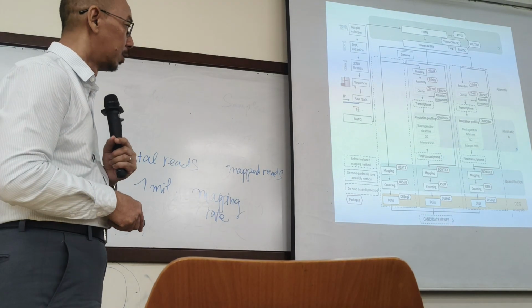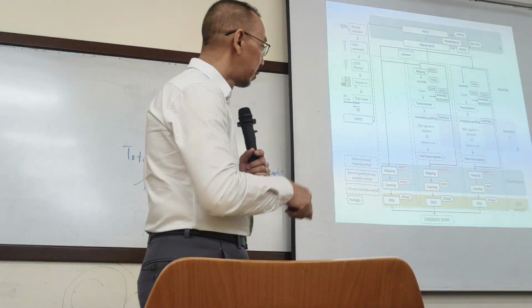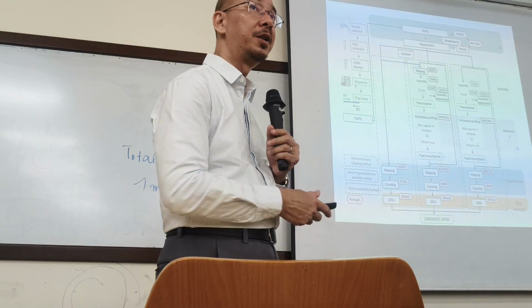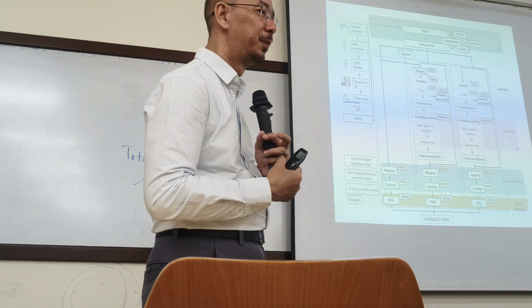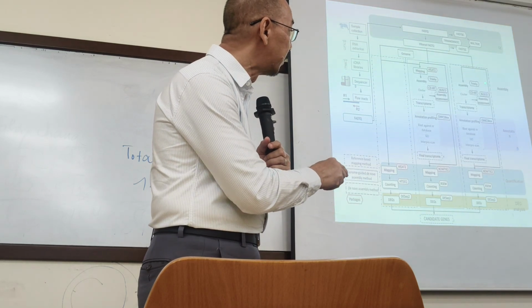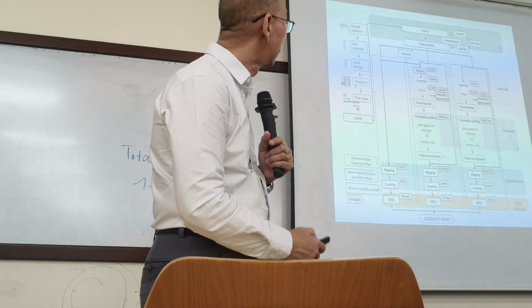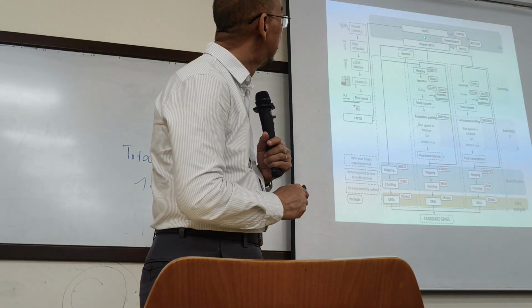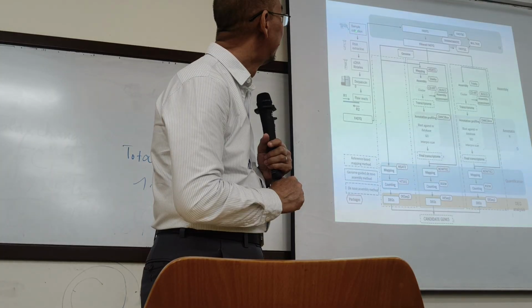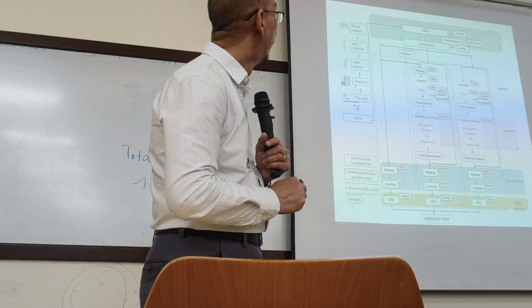And then here I show you the whole flow chart of how to study gene expression, but this one is not yet published, and I also show you the programs to run. We start with the sequencing.